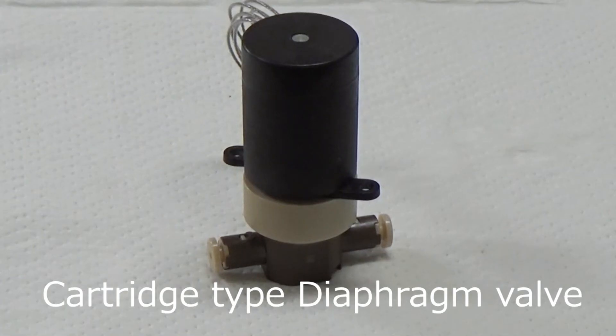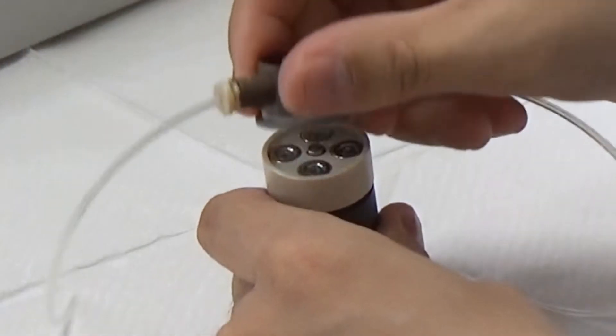Hello, today we would like to introduce the cartridge type diaphragm valve whose wetted parts can be easily removed and replaced.